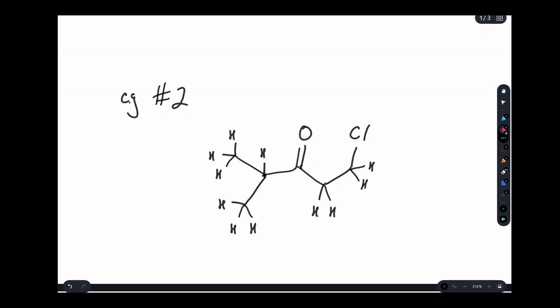If you got your answer, let's take a look. So let's start from the right side here. These 2 hydrogens would be expected to be the same, as they're connected to the same carbon and are able to rotate. They would be expected to have an integration of 2. Just to be clear, the fact that they're labeled as A doesn't really matter. You can label them whatever you want as long as those two are labeled the same.